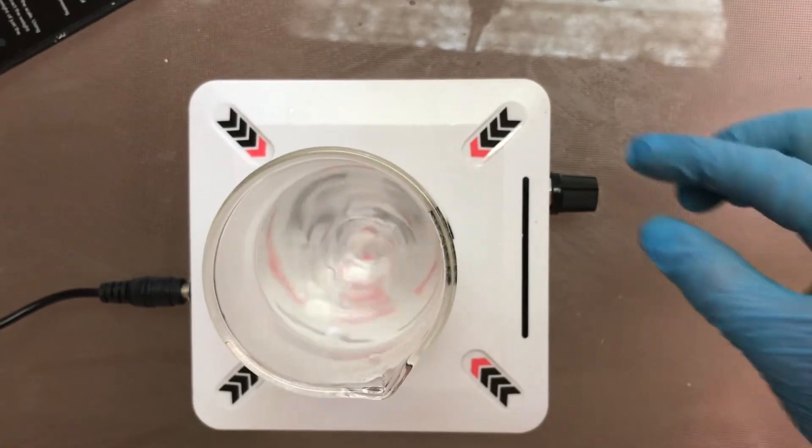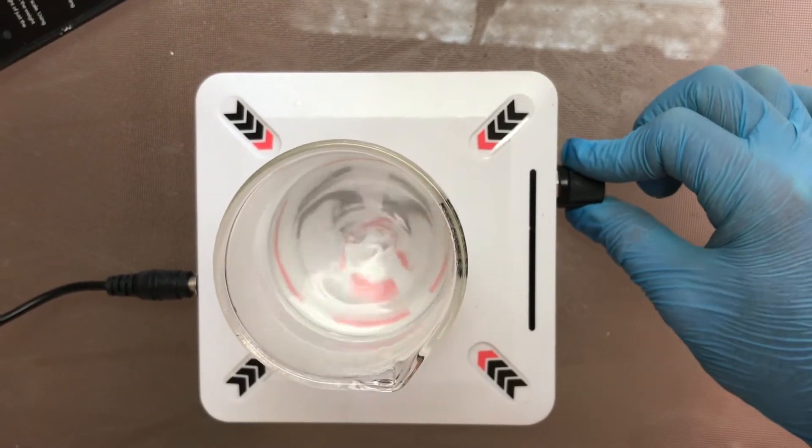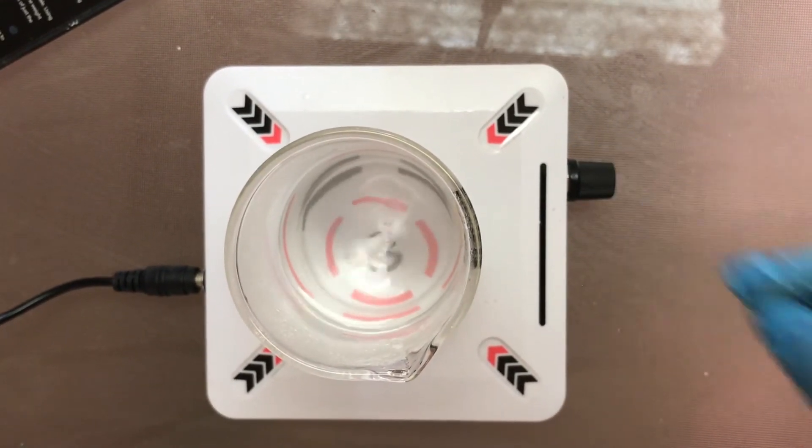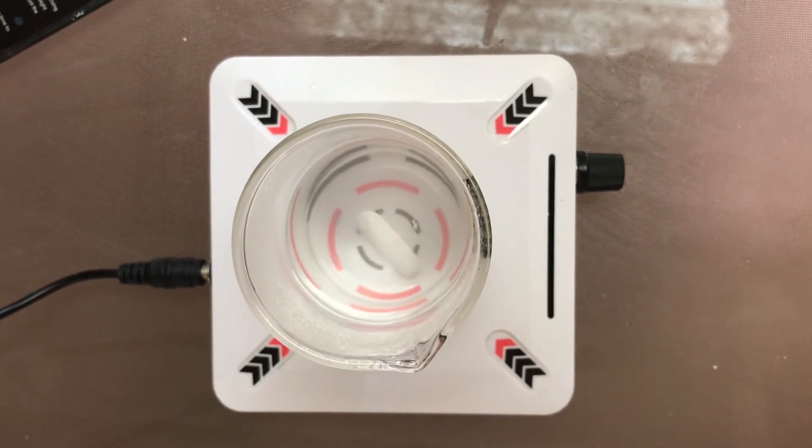Continue stirring until the sodium hydroxide is dissolved. The liquid will become transparent. Once it is transparent, turn off the stirrer.